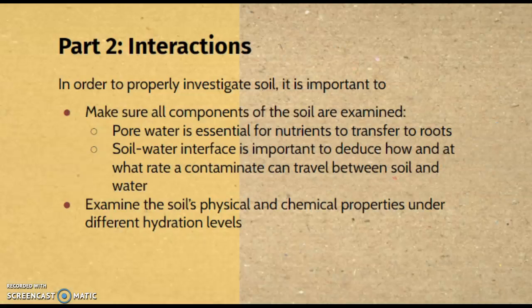The second category talks about interactions, and going back to soil chemistry, to properly investigate SOM, it's important to make sure that all components of the soil are examined, specifically the pore water, which is essential for nutrients to transfer to the roots, and the soil-water interface, which is basically a measure of the rate that contaminants can travel between water and soil.